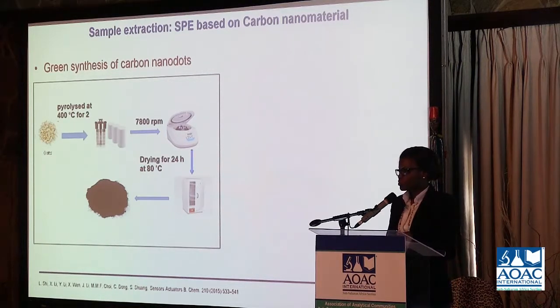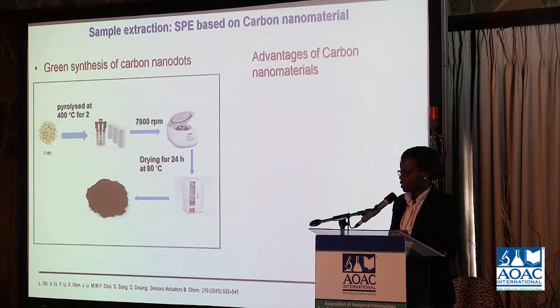Thereafter, after cooling, you disperse it in ultra pure water to remove the larger particles. And before that, after pyrolyzing in the muffle furnace and cooling, you grind it into fine powder. That is how you get the carbon nanodots. Then you disperse it in ultra pure water to remove the larger particles. After centrifuging, you dry the obtained product for 24 hours at 80 degrees Celsius, and then you obtain your products.